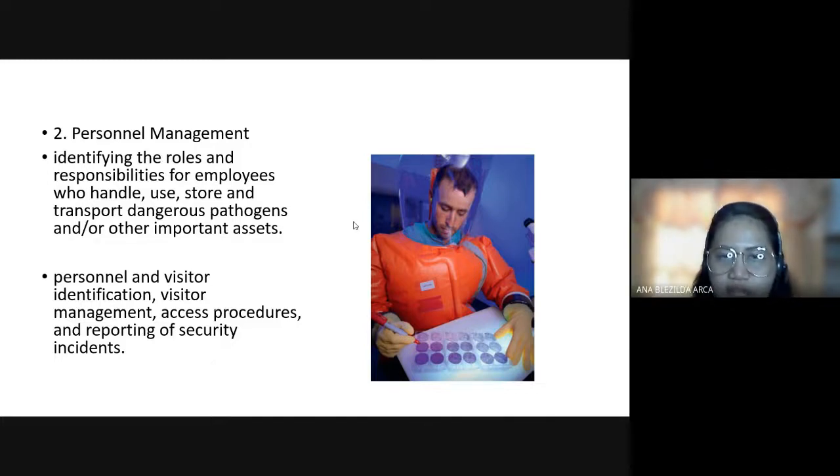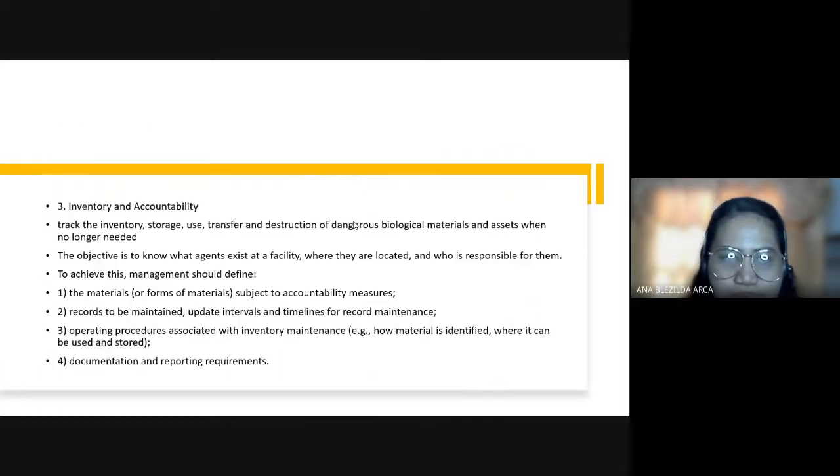And you must also identify sino ba yung mga visitor, di ba? Sino lang ang pwede pumasok sa laboratory. Usually class, kapag mga highly secured laboratory, walang visitor, bawal ang visitor class. And then yung mga employees dyan are scrutinized and merong background check.